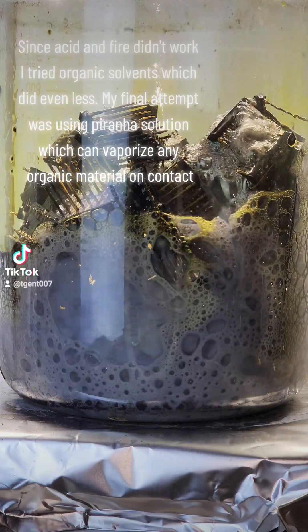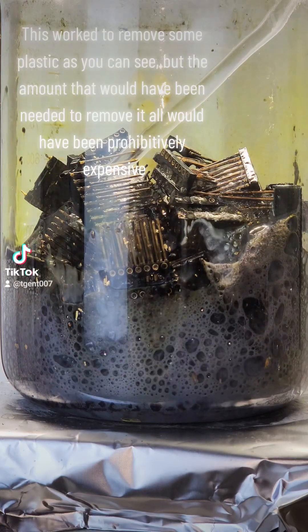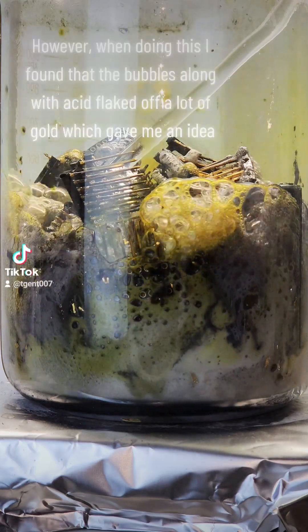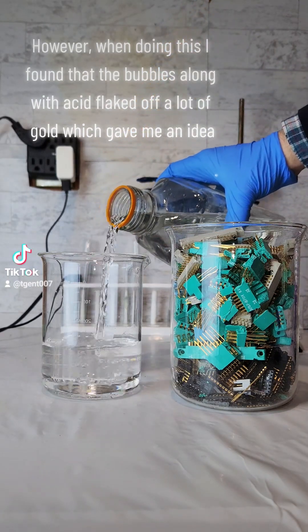My final attempt was using piranha solution, which can vaporize any organic material on contact. This worked to remove some plastic, but the amount needed to remove it all would have been prohibitively expensive. However, when doing this, I found that the bubbles along with acid flaked off a lot of gold, which gave me an idea.